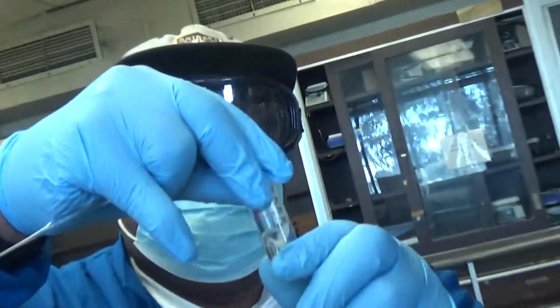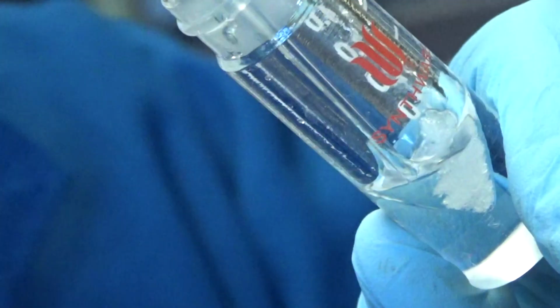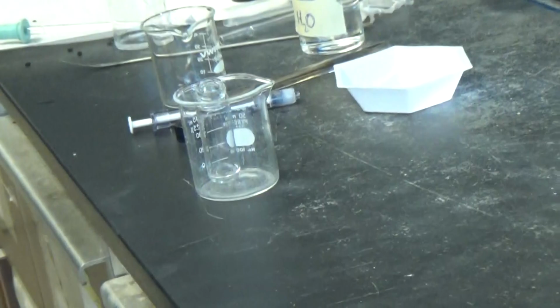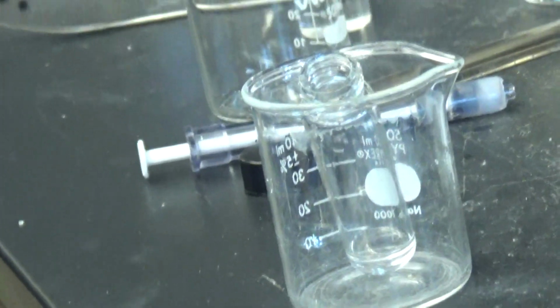So you got the product with the salt, with the sodium sulfate. You're tilting it a bit just to get that product out and put it into the other vial. Okay, it's all gone. So you got most of the product. A little bit left behind, that's probably okay, because we don't want some salt. So that should be semi-pure product, right?